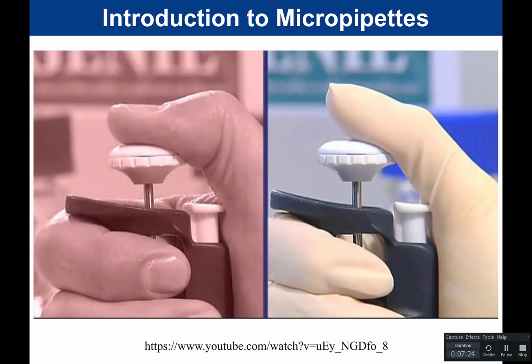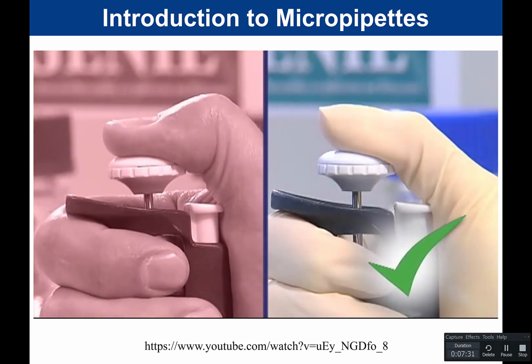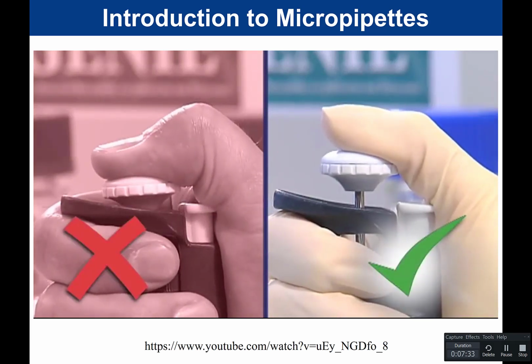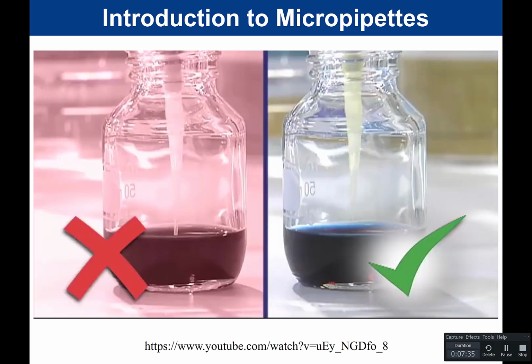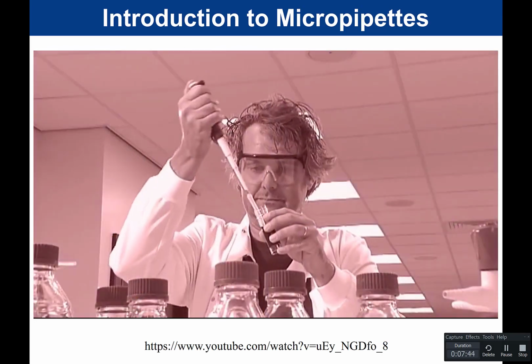When pushing down the push button to take up a set volume of liquid, don't push past the first stop. If you push past the first stop, the volume you then take up will be too large. When taking up liquids, don't simply let go of the push button.